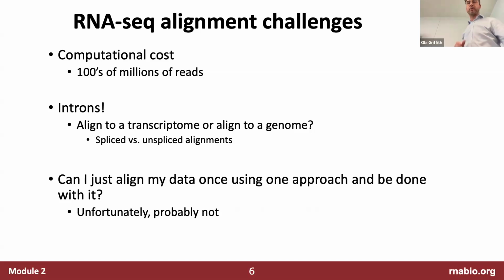RNA-seq alignment comes with some shared challenges and some unique challenges. It can be computationally expensive. There's a reason why we're downloading and aligning these unrealistically small data sets, because if we had a realistic data set, it would probably take hours.